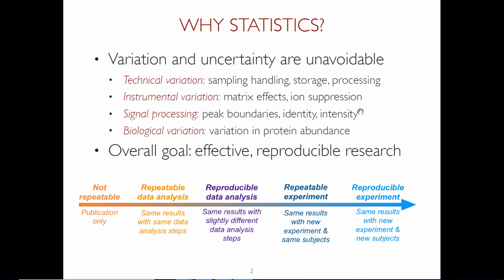And so the goal for us, if we want to do relative quantification, if we want to know what changes are induced by stresses, conditions, diseases, and whatnot, is to be able to distinguish the systematic change which was induced by our stress from the artifacts of random variation, which come either from biological reasons or from technological reasons. The whole point of these 2.5 days and also of the next 2.5 days is really that: how can we distinguish random variation from the systematic changes in abundance which are induced by the stresses or conditions we're interested in.